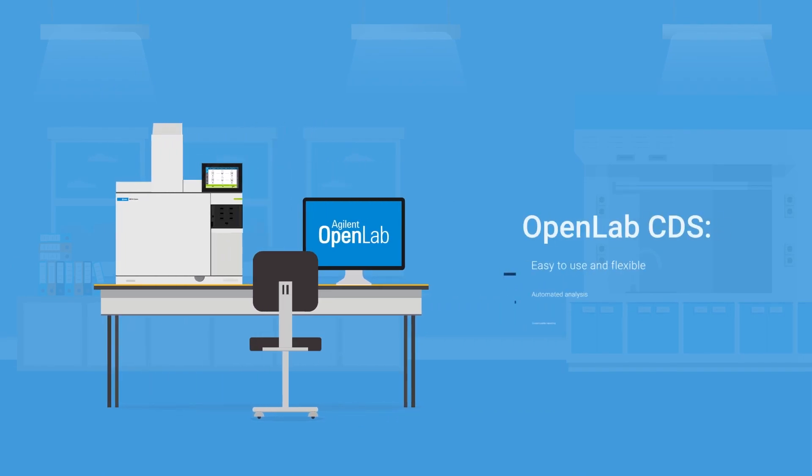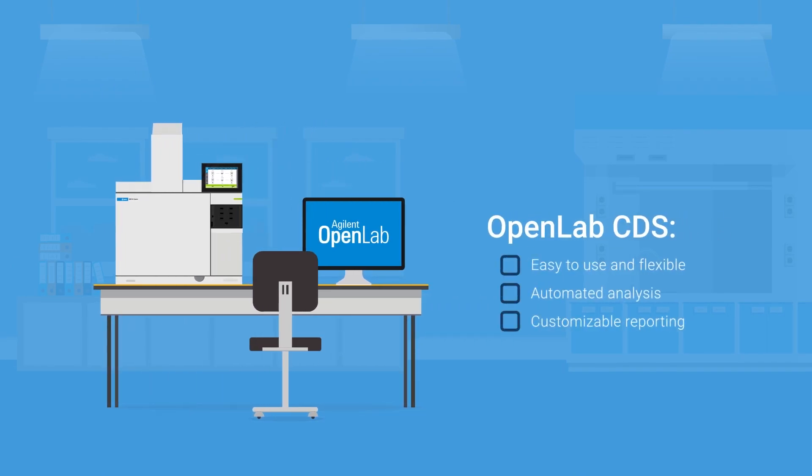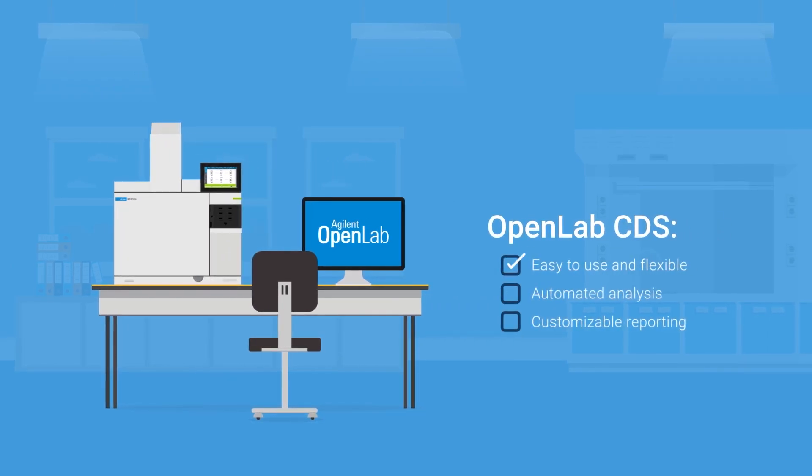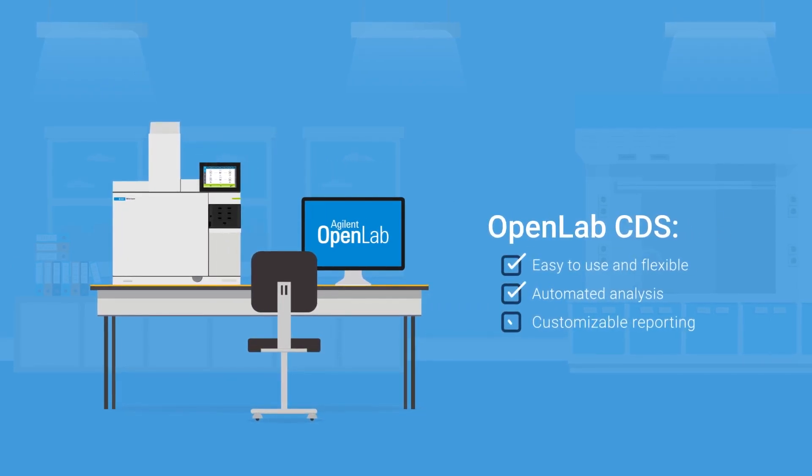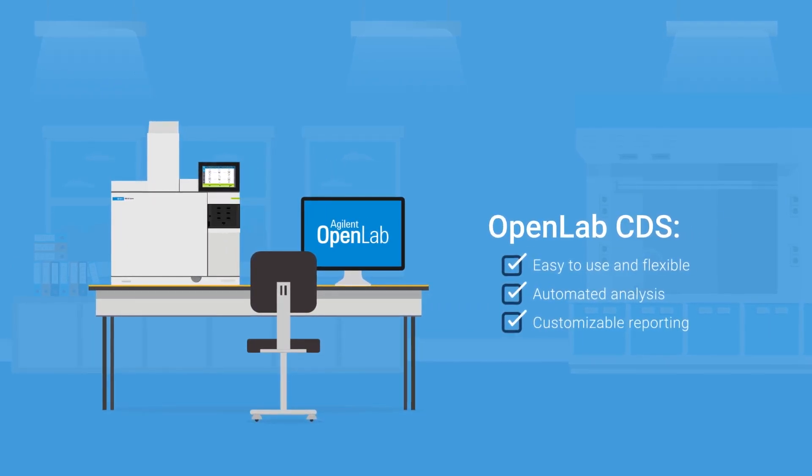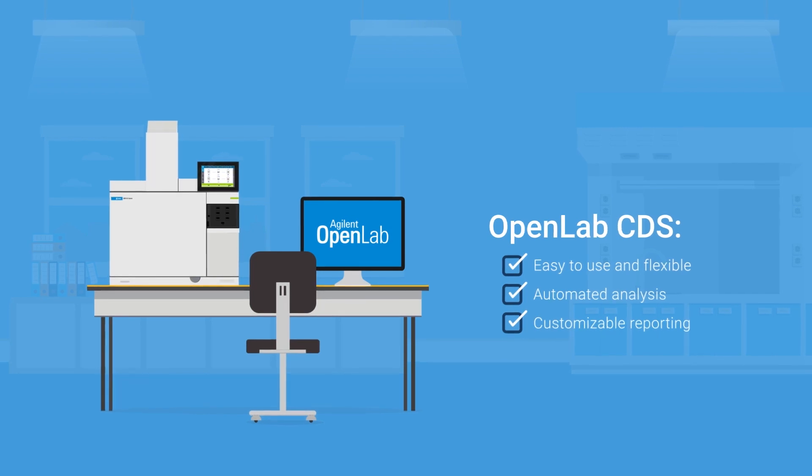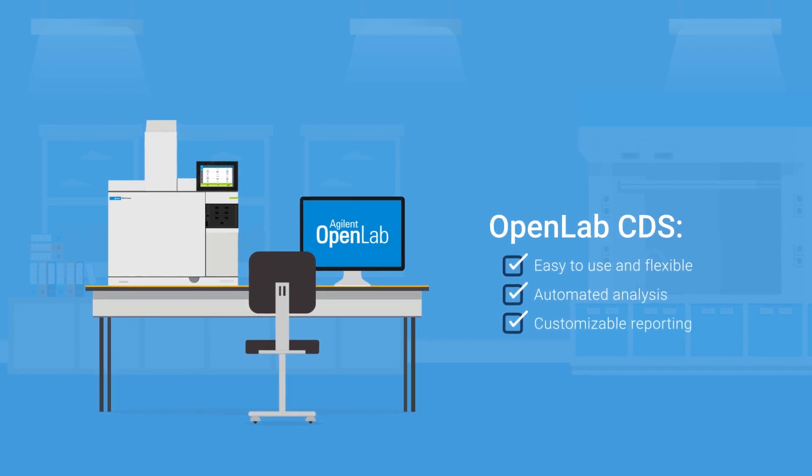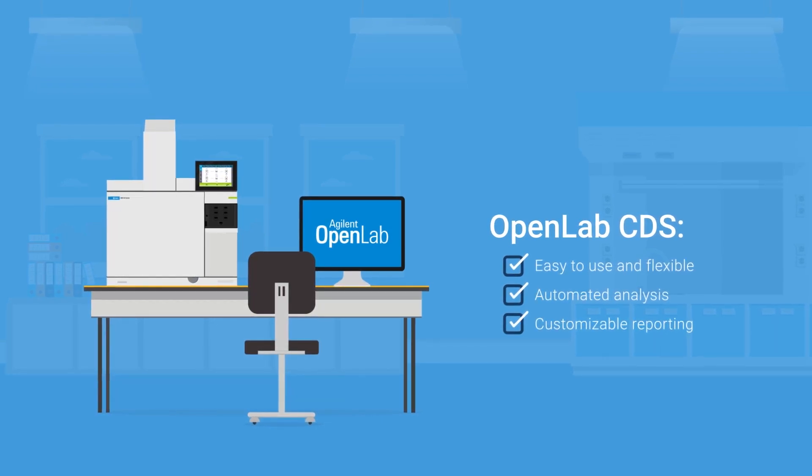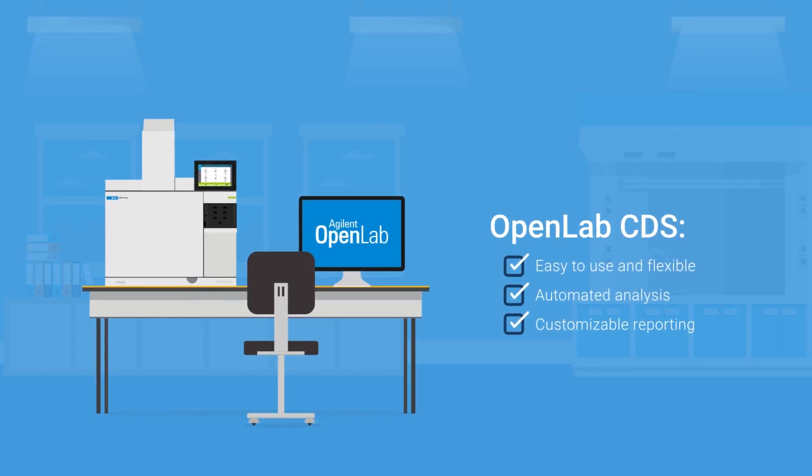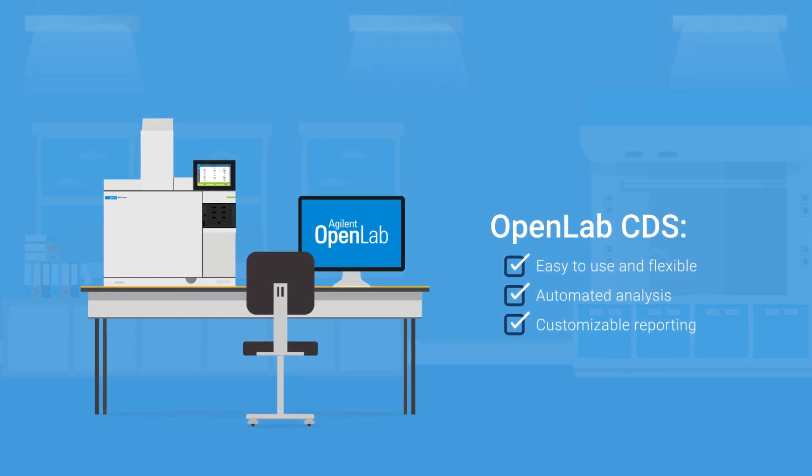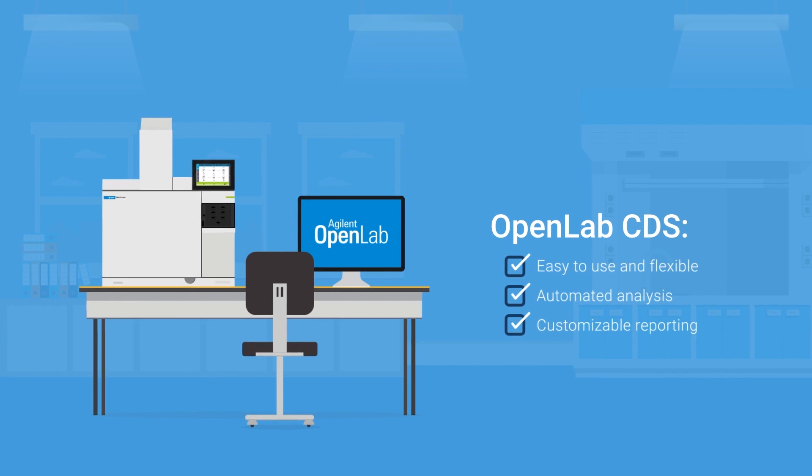With its simple interface, flexibility, analysis tools, and customizable reporting, OpenLab CDS will help you get actionable results faster, saving you time and money.